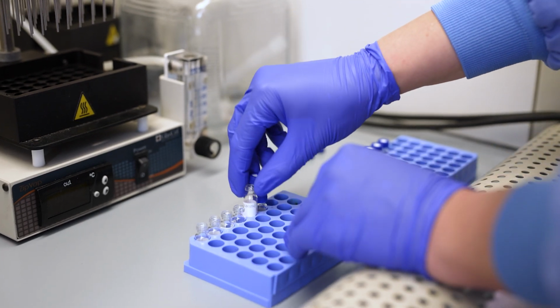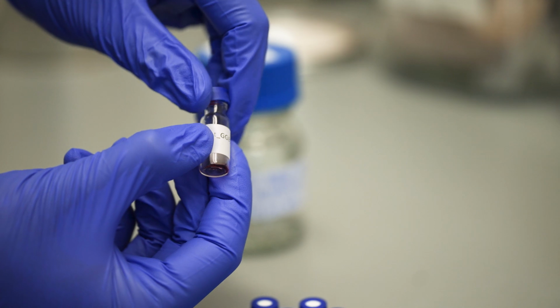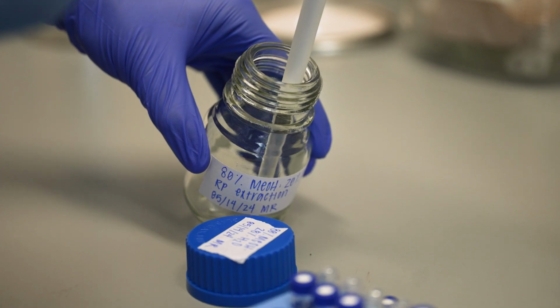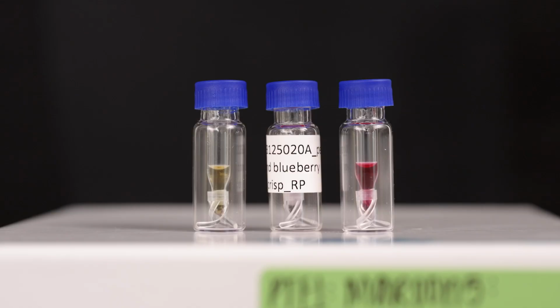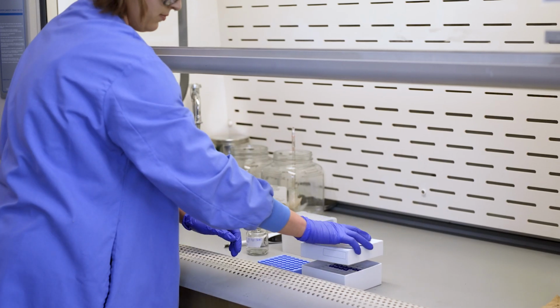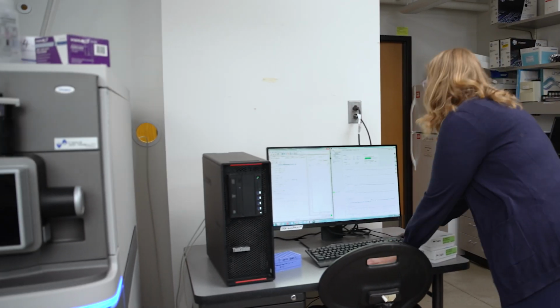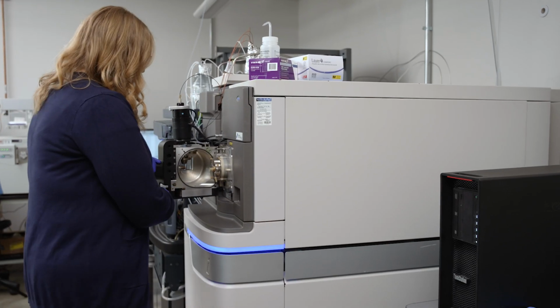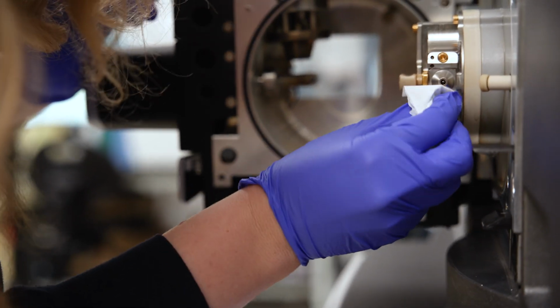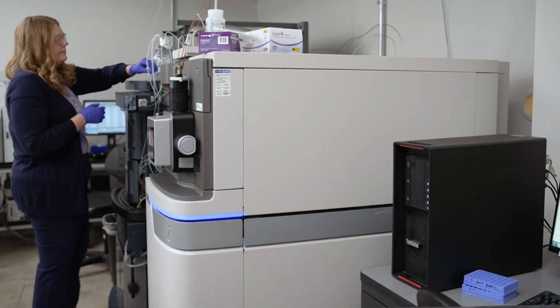Following the isolation of small molecules, samples are dried under nitrogen to remove extra solvent and resuspended to a volume suitable for analysis with analytical instrumentation. To measure these small molecules, the PTFI uses a standardized method which aims to detect all the small molecules of food, some of which are known and some of which are not. This method involves separation of molecules by polarity using liquid chromatography and by mass using mass spectrometry.